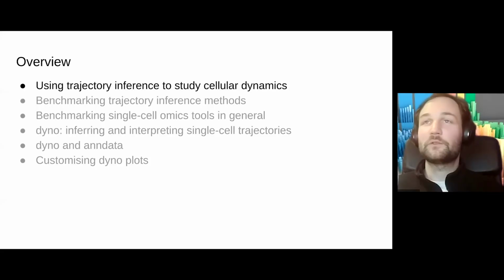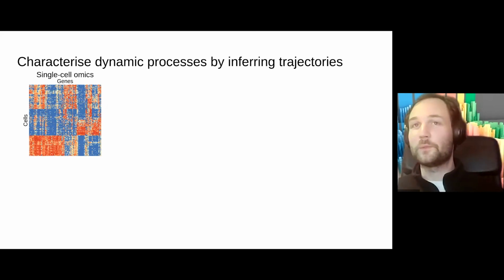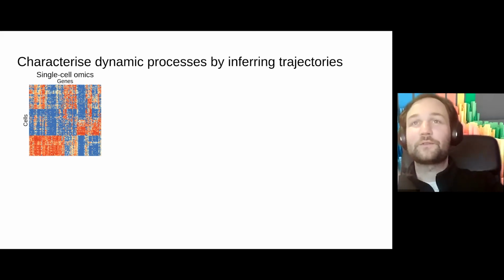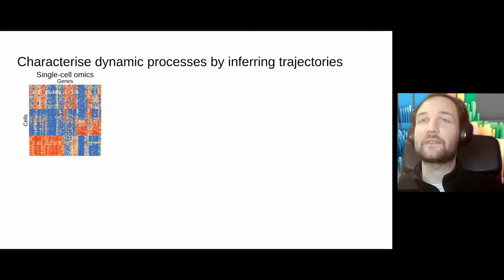So excellent. I will talk a little bit about the dynverse project, which is more specialized towards running trajectory inference analyses and everything that surrounds this. We've heard about lots of different toolboxes in these sessions, and they're all fantastic in their unique way. The unique way that we're trying to tackle this is with a specific focus on analyzing dynamic processes within single-cell data sets.